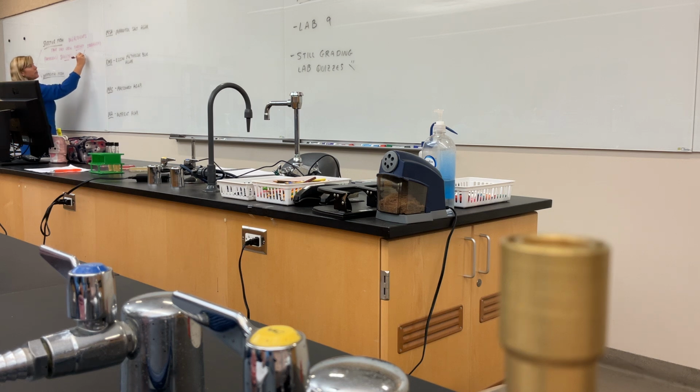This could be certain types of sugars. And if my organism can't eat that sugar, then what's going to happen to them? It'll die. Yeah, so I want to get rid of them. This is a way I can get rid of background noise. All right, so I'm selecting out the organisms. I can do certain food.